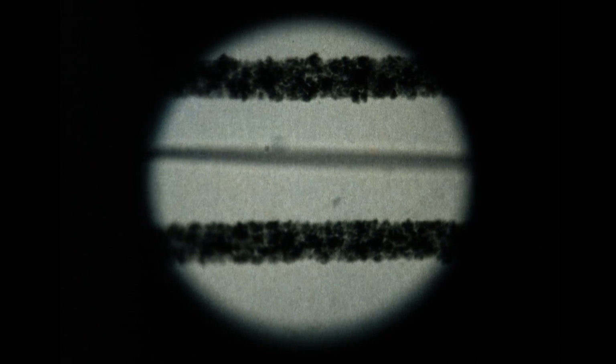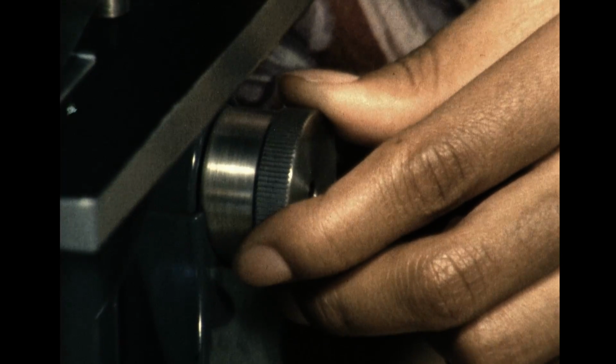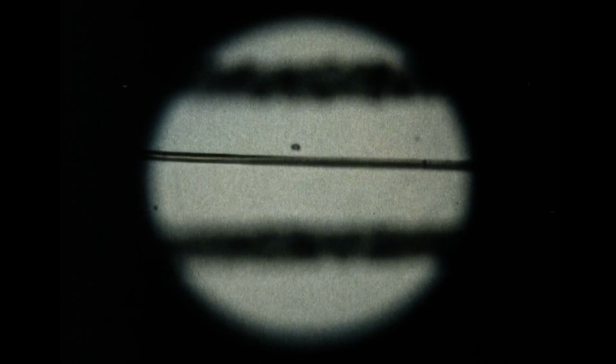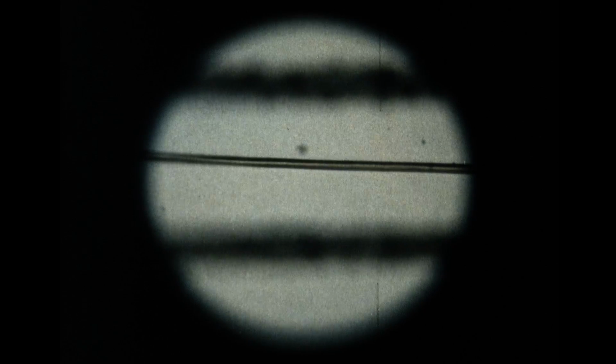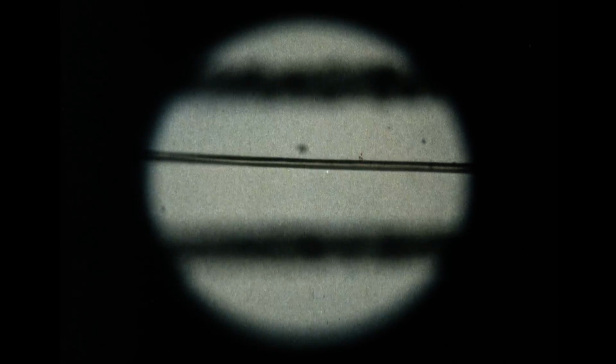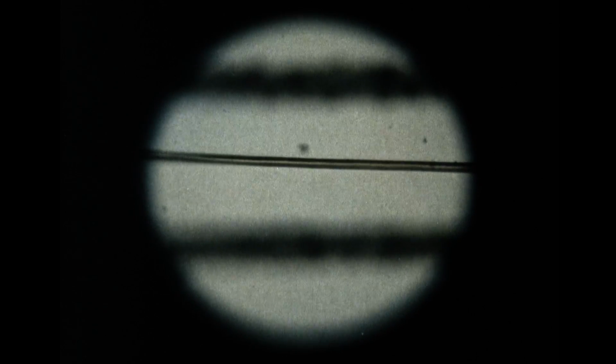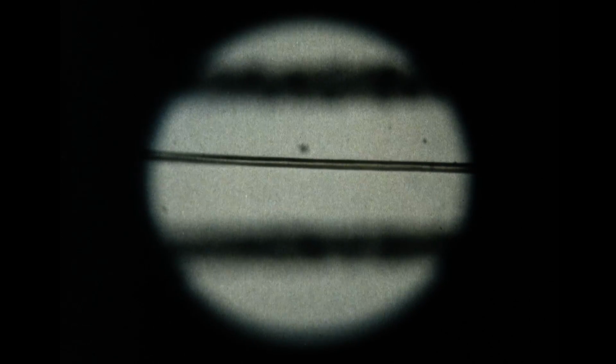The microscope focus is so sensitive, it can wander up and down different levels. Now the hair is in focus. A rough estimate shows that the hair occupies approximately 1/20th of the millimeter area. Consequently, the width of the hair is about 50 microns.